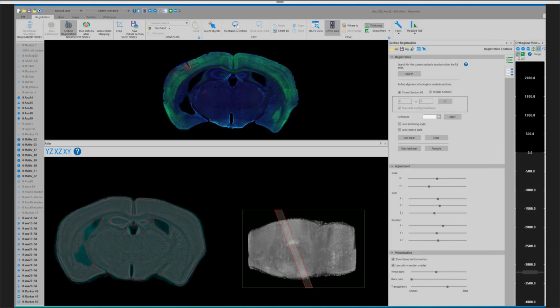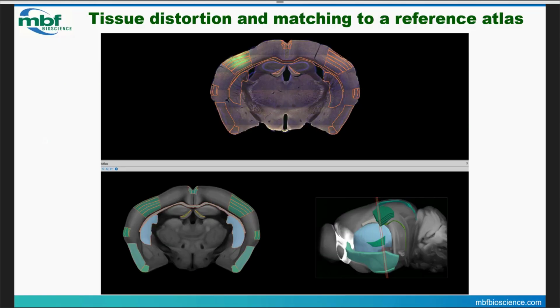We've been able to handle some fairly extreme cases of angular offset, and then Chip's going to jump in with some of his presentation and talk about when linear methods aren't enough, or don't quite get you there with the fit. You can often employ a nonlinear registration to the Allen space and accommodate for things like physical deformation, like due to an injection depression or something like that. So we're going to give examples of all of that. And Chip, with that, you should be good to go.